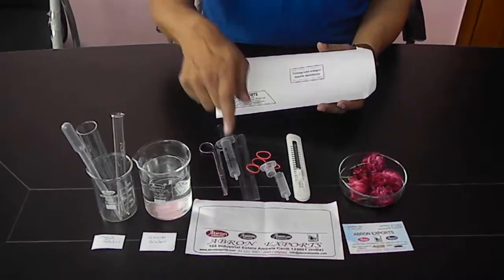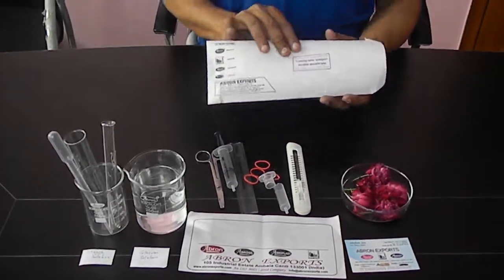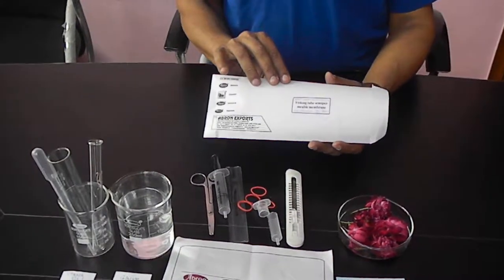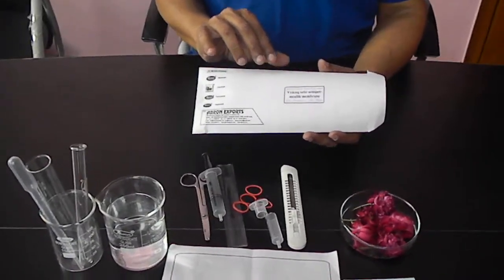This is the whisking tube by Abron Exports. It comes in an envelope, available in 1 meter, 2 meter, 5 meter, and 10 meter lengths.